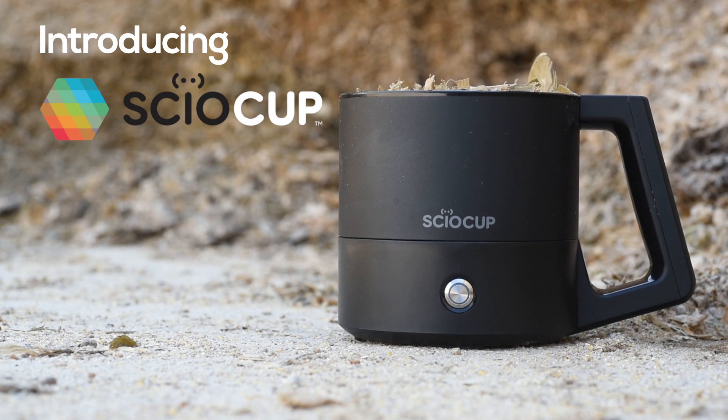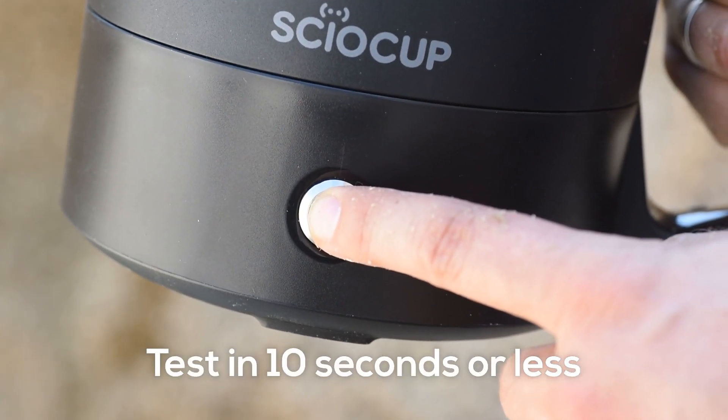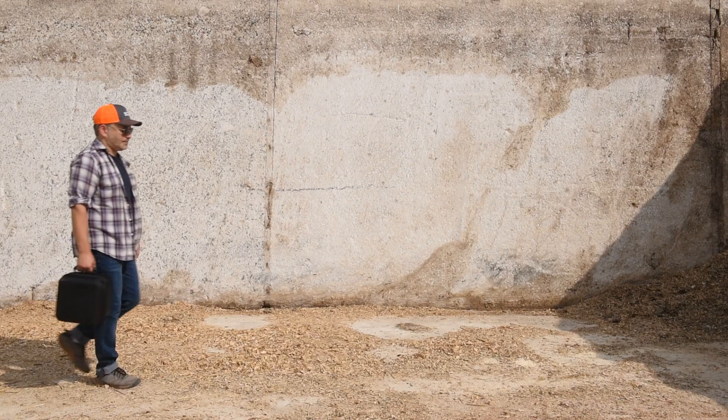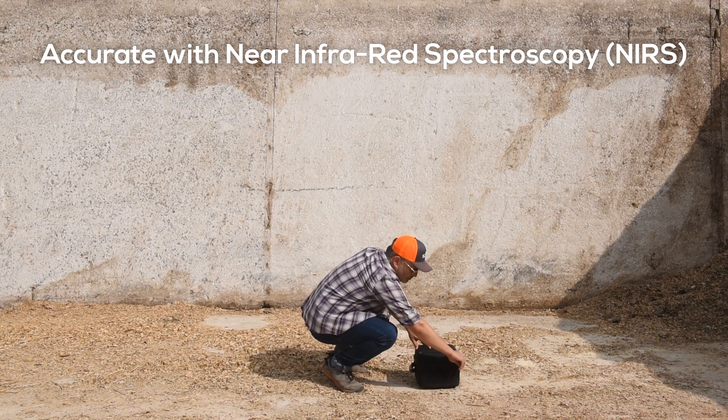Introducing Sciocup — the world's fastest lab-grade dry matter analyzer. It makes life easier. It's easy to use. The cup itself is portable, intuitive, and works anywhere on the farm.